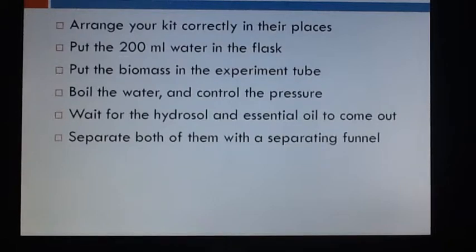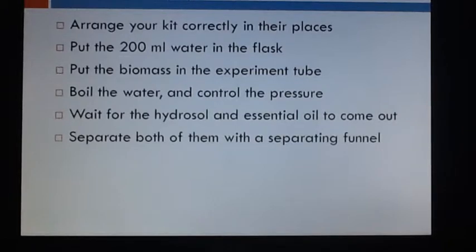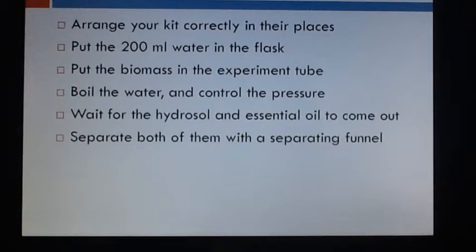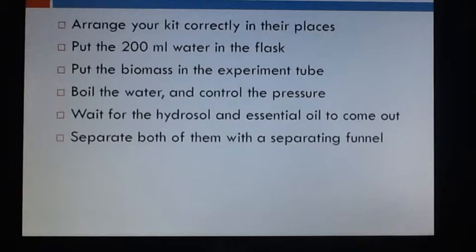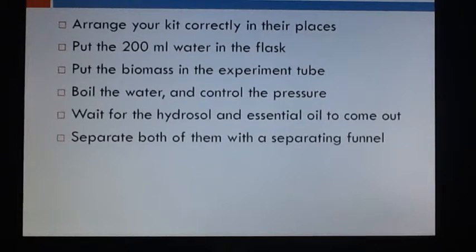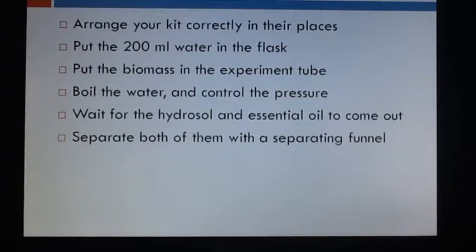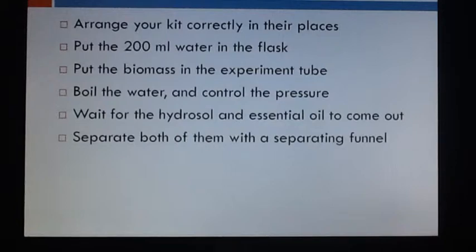5. Wait for the hydrosol, or the scented water, and the essential oil to come out. 6. The essential oil will be floating on top of the hydrosol, so you will have to separate it with a separating funnel. And be careful not to spill the undiluted essential oil on you. It will burn, and secondly, it's bad for your skin. If you get spilled with the concentrated essential oil, do not wash it with soap because it will make it burn even more. What you have to do is wash it with oil, then you wash it off with soap.